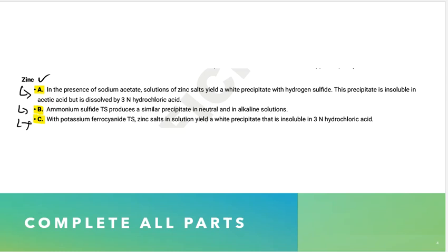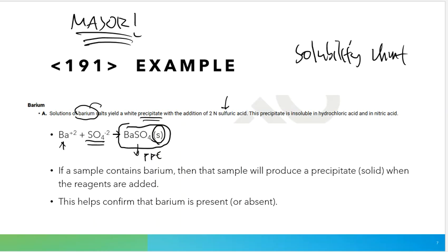If I did the chloride test, and that chloride test did not tell me, oh my gosh, you've got chloride, you get a white precipitate, if I don't get it, chloride's not present. Why would I do the other tests of the monograph? I'm just not going to do it. Now, maybe I'll double check myself. Maybe I'll do that test more than once. But again, the idea here is that these are major players, and we are looking for the major players in the chemical identification test that we are seeing, and the instrumentation identification test as well. That's what we're looking for.